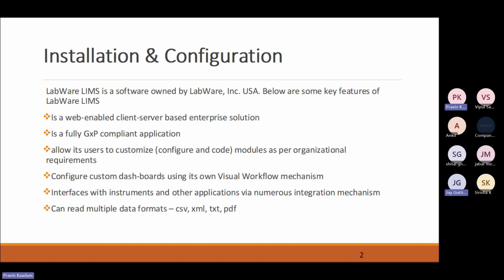When it fulfills all the electronic record and signature requirements and auditability. These are the major requirements. Everything should be captured in electronic record and signature. All the user capabilities, everything should be traceable. Traceable, correct.